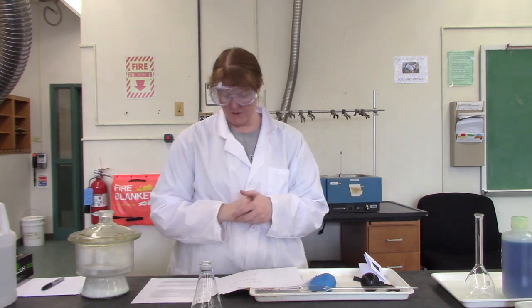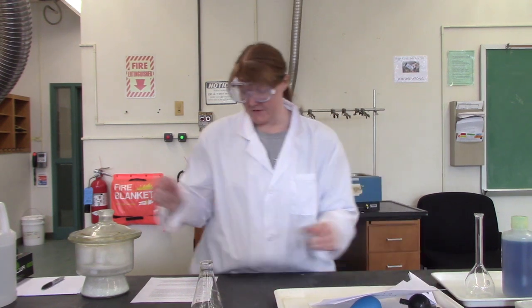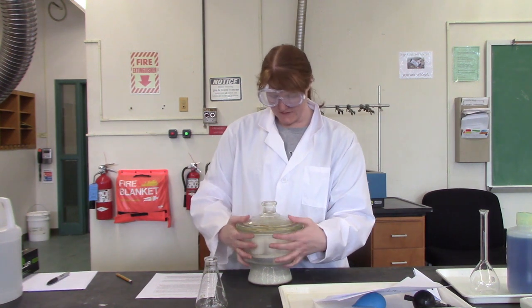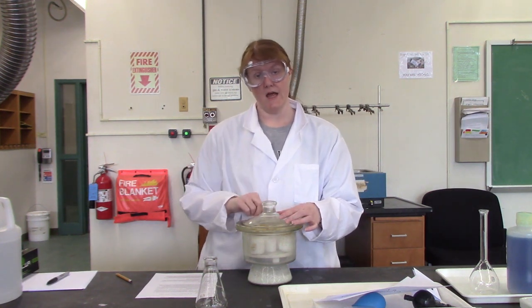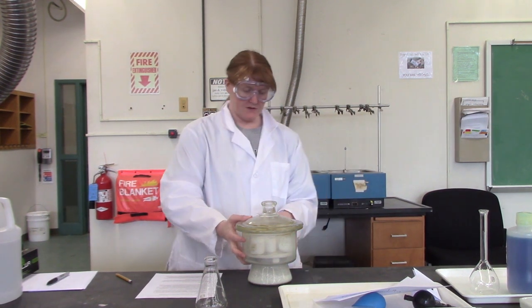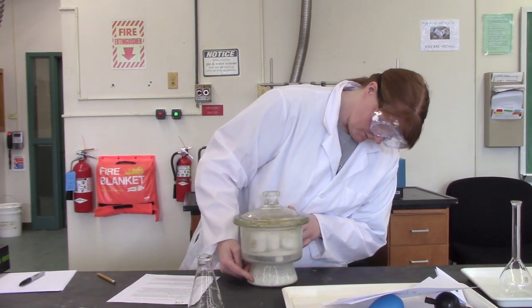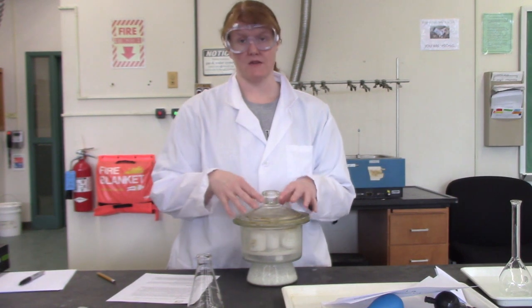All right, so the first part is making your oxalic acid solution. This is a little tricky. Oxalic acid is our standard for this experiment, which means we need to maintain it in an environment where it's not going to absorb water or dust or anything kind of weird. We don't want any contamination. So we have this device, which is called a desiccator. A desiccator has vacuum grease around the outside edge to seal out most of the atmosphere, so that what's in here is relatively stable, and we have a desiccant down here in the bottom. This stuff changes color as it absorbs water, and we just heat it up to dry it out again and put it back in. That absorbs water from the air inside, so it prevents excess water from building up.